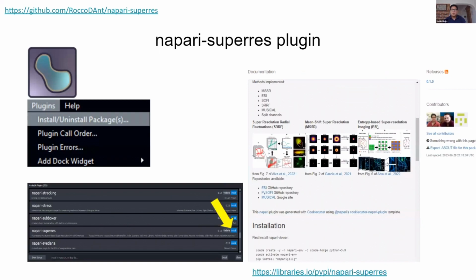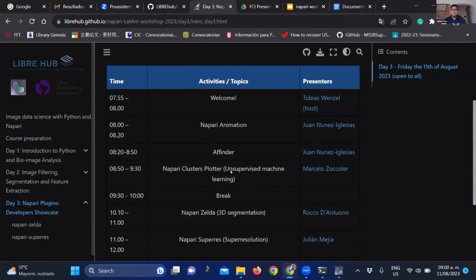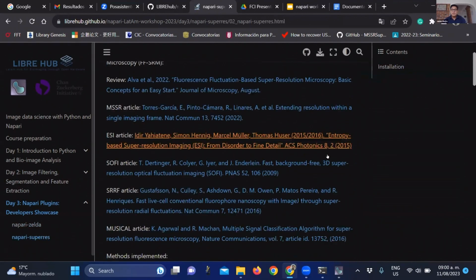So let me start showing you what we have to cover today. For that, I will refer you to the webinar page. In here you have the schedule, but then in day 3, you can go to the Napari Zelda that Rocco just presented, or you can go to the Napari Superres. In here you have plenty of information.